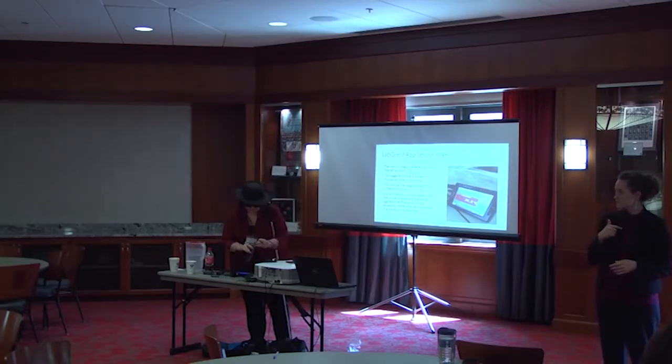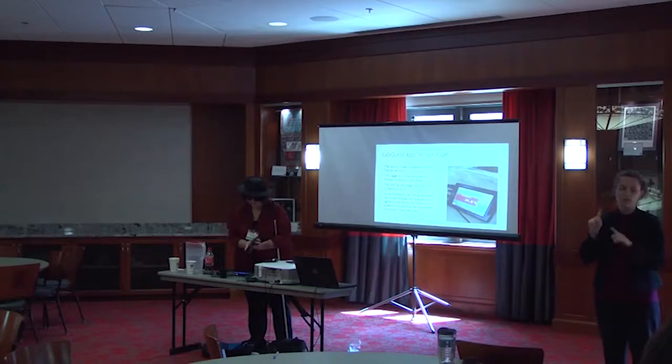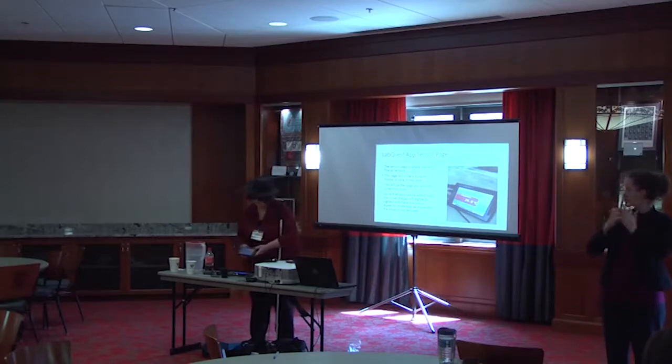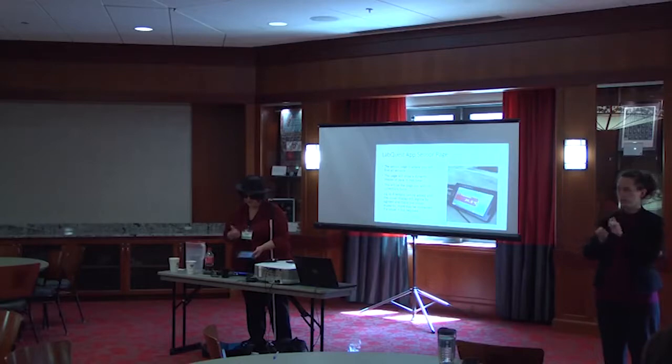Cooperate with me. Menu item new. Text box length. Sensor page. There we go. Detail box data collection. I got stuck in a menu. 21.3. So, Menu. File. Menu. Sensors. Menu. Readout. Check menu item. Menu. Live sensor tone.